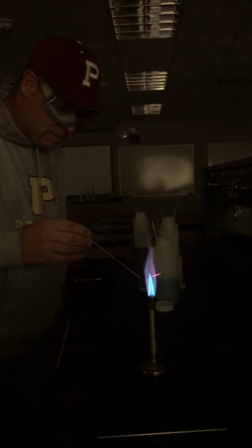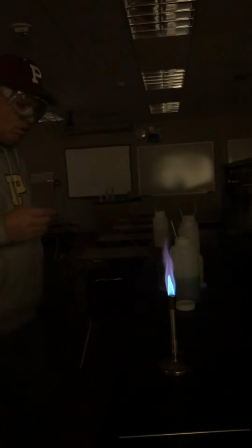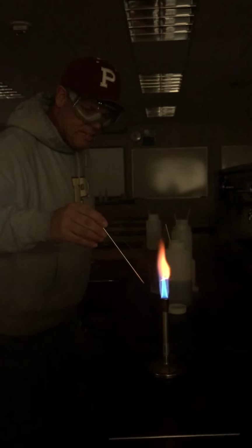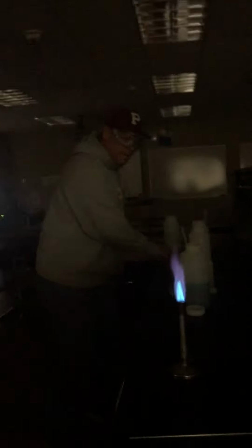See, it burns a little blue. Now, again, it's one of those things, if I put that back in there, what you're going to see is the inoculating loop. Okay? So you got to be careful of that. So that was iron.